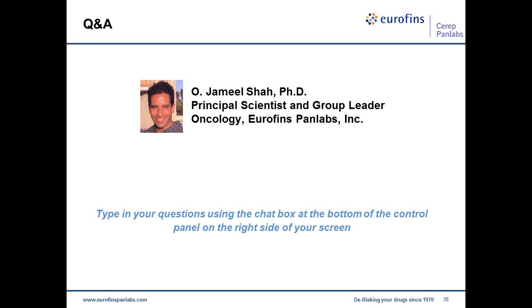Second, can we use gene expression, copy number, mutational data of Oncopanel 240 cell lines growing in spheroid culture, not growing in 2D? The short answer is yes, you could, but I think maybe the bigger question is, would you want to?